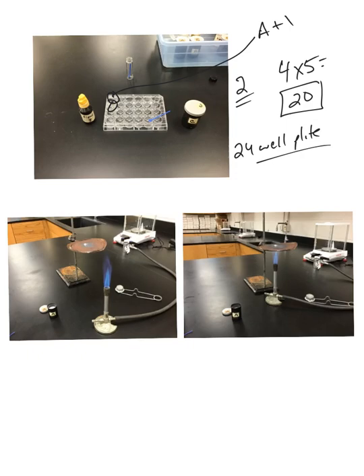Now, right now in this picture, what's bad about it is you've got a black background. I actually find a white background to be better. So what I would do is take a white piece of notebook paper and put it underneath that well plate, so it's a little bit easier for you to see any of the different colors or reactivities if they're not quite as prominent. Okay? So once you've got the test done of the liquids, you'll fill that out in your data table.